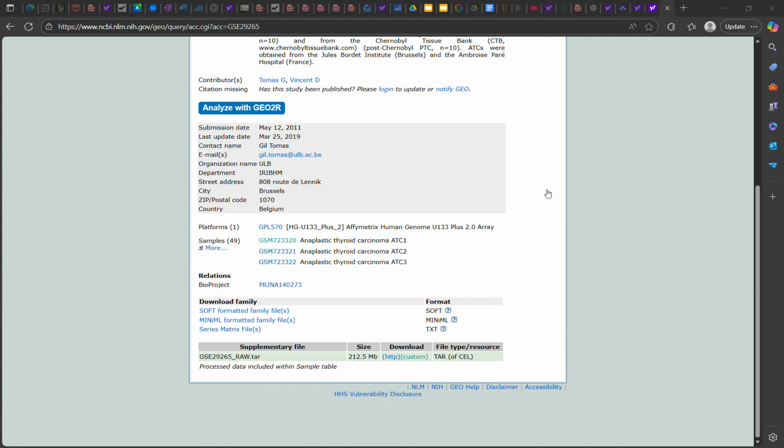So let me go back to the normalized expression. Yep, and here we go. ID is right here. And it's a little better because it's the ID of its own row, and everything's numbered 1 through so on, and the ID is in its own column, so that everything is a little bit neater and easier to understand. And there we go. That's all the code you really need.